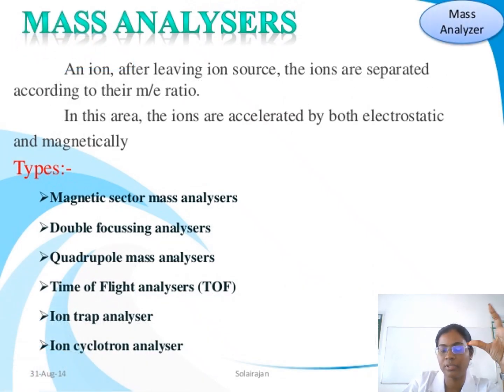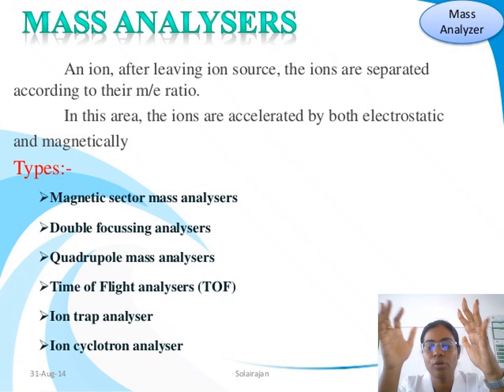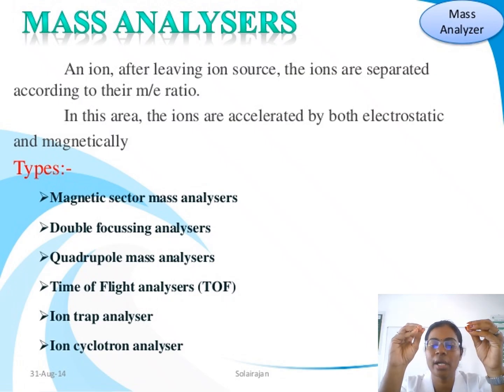Then the first one is the sample injector, present in a vacuum or without vacuum. Then it goes to ionization, and finally it is converted and goes to the analyzer. Here is the separation of molecules, which depends upon the mass of the molecule.